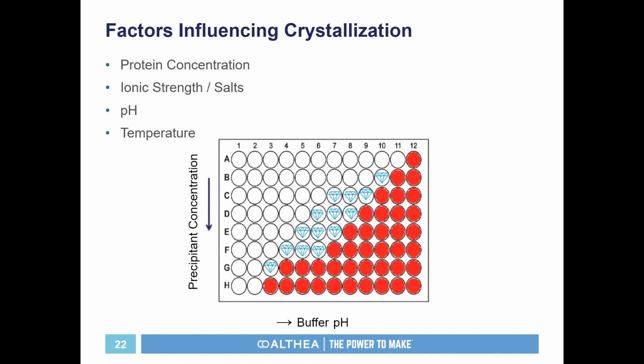Now, this picture down below gives you an example of some of the phase diagrams that we usually map at the very beginning of our projects. At least if we're lucky, we get to see that crystallization window in the beginning of our batch development process. The red wells indicate aggregated protein. The crystals are that happy window where the proteins will crystallize. And then the clear wells are the conditions where the protein stays soluble and does not crystallize.